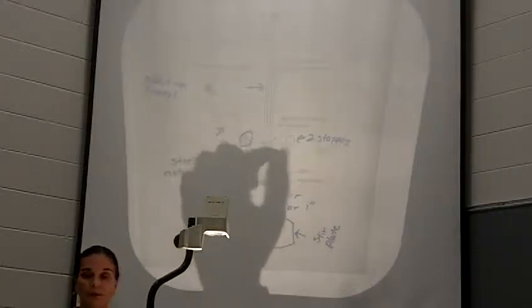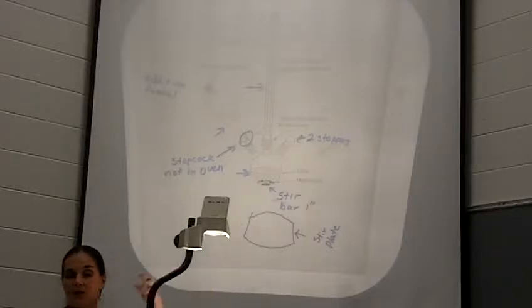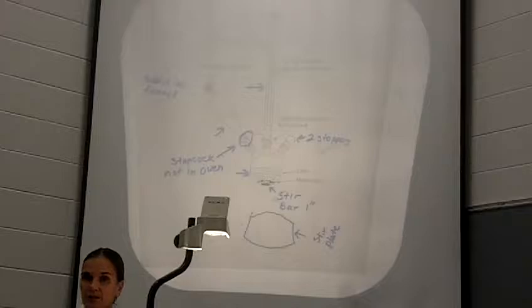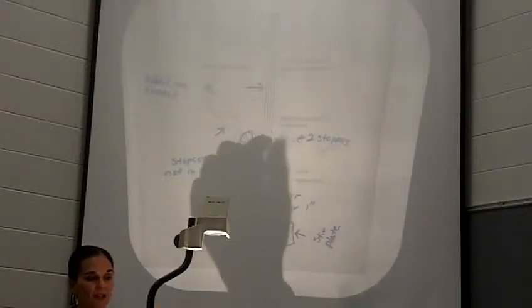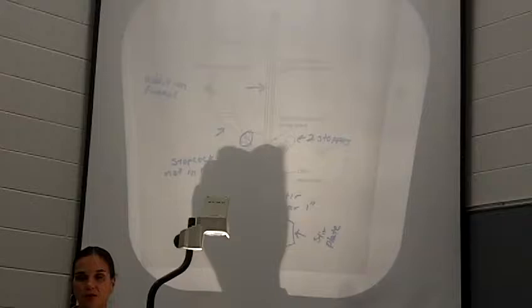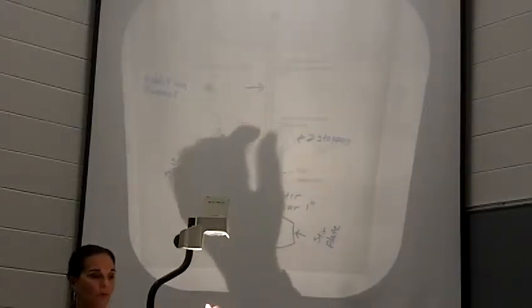So, another trick with that, the magnesium and the ether: sometimes the magnesium is pretty staticky. So if you add your magnesium through your powder funnel, then add your ether through that, it'll help rinse the magnesium into your round bottom flask. Okay? And the other thing you've got to be careful of is just don't get the magnesium stuck in the joints, because it makes it hard to seal things together.